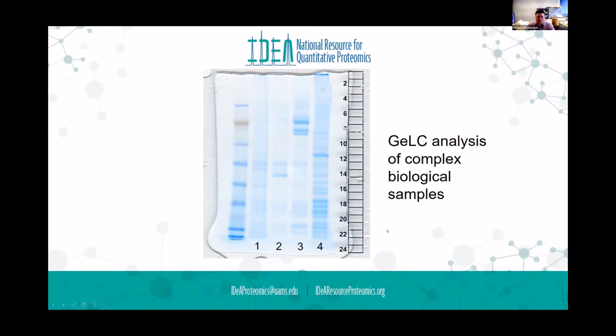In the real world, there are a couple of ways you might separate samples other than the serum example. We don't do nearly as much gel-based analysis as we used to, but this is an intuitive way to think about it. Instead of doing a single shot analysis of the cell lysate or a pull down experiment in this case, we used to do this commonly: we just take the complex sample, run it out on an SDS-PAGE gel and cut it into 24 slices from the top of the lane to the bottom, and then separately analyze each section of the lane.